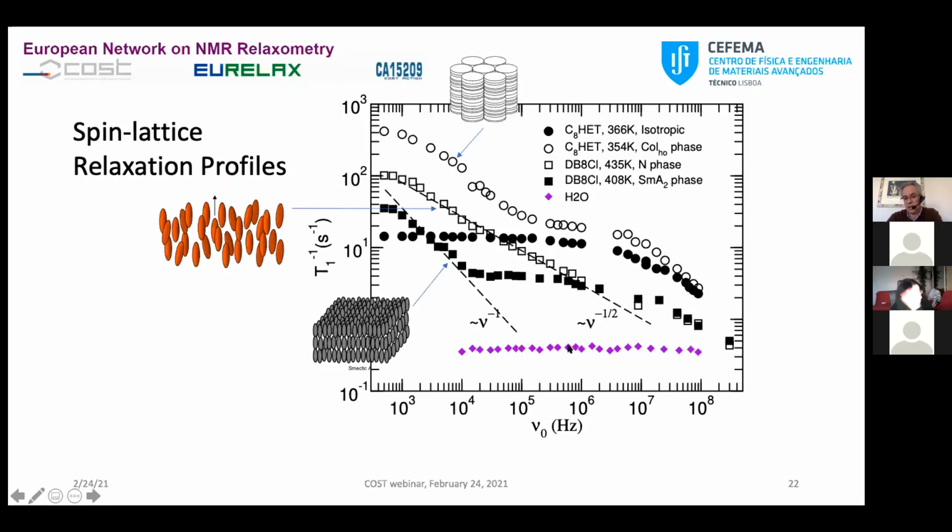As I said, there is no way I could think that my complex system, which shows all these features, could bear a similarity with the water molecules moving in bulk water. They don't. They look the same, but this is a completely different reality. So it is not advisable to look at the relaxation dispersion alone and just try to guess what might be the structure behind it.